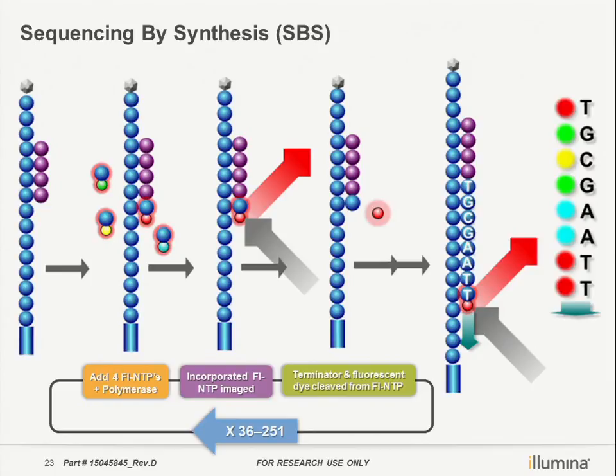So you can just interpret one cycle equals one base pair. If you're asking people how many cycles they are going to sequence, and they say 2 times 150, that means they're going to sequence paired-end, and each end is 150 base pairs. So this is what we mean by cycles. The whole process repeats depending on how many cycles, or what some people call read length.